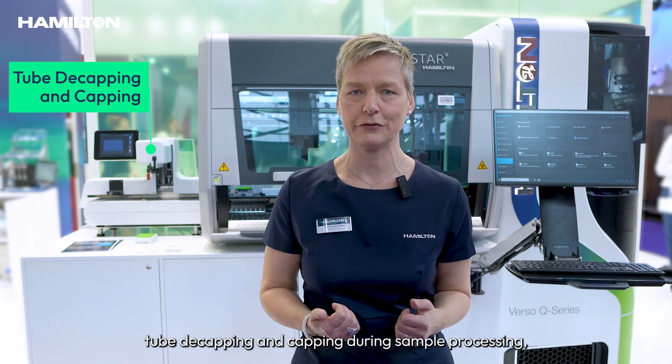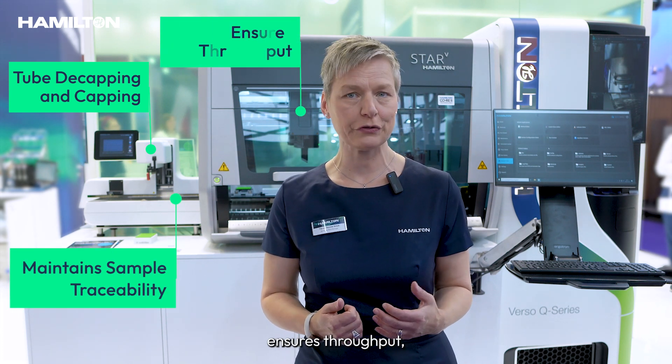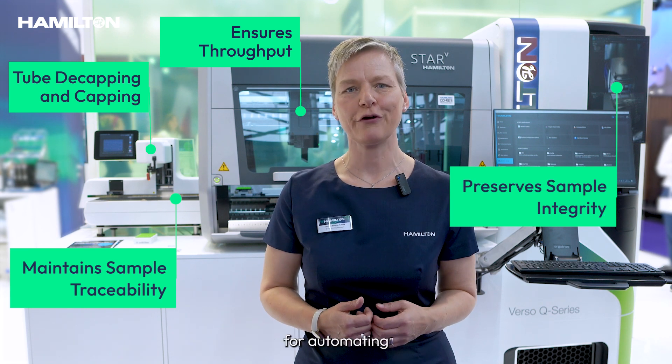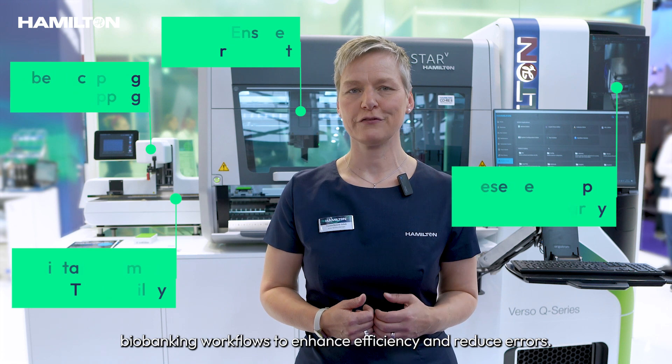This Q20 eliminates the need to search for samples manually and ensures sample integrity by maintaining a consistent temperature. This integrated system addresses numerous challenges in biobanking workflows, handling tasks like tube decapping and capping during sample processing, maintaining sample traceability, ensuring throughput, and preserving sample integrity. It's an excellent solution for automating biobanking workflows to enhance efficiency and reduce errors.